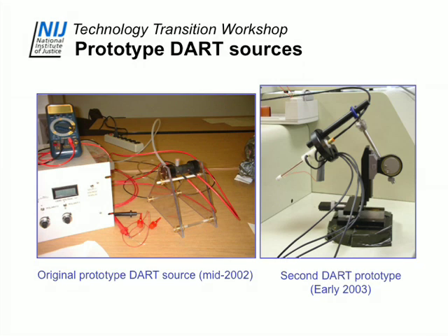We really envisioned this thing as being a gas phase thing, so we built this little thing on a stand and hooked it up to a meter and started squirting gas in it with a gas-tight syringe, and it looked like the picture on the left. It gave us all kinds of interesting readings that we didn't understand. We kept making graphs with Excel and plotting them out and didn't really know what was going on. So I said, we've got to figure out what's going on in this thing. So we took one of the end caps off and pointed it at a mass spectrometer, and that's when all the fun started.